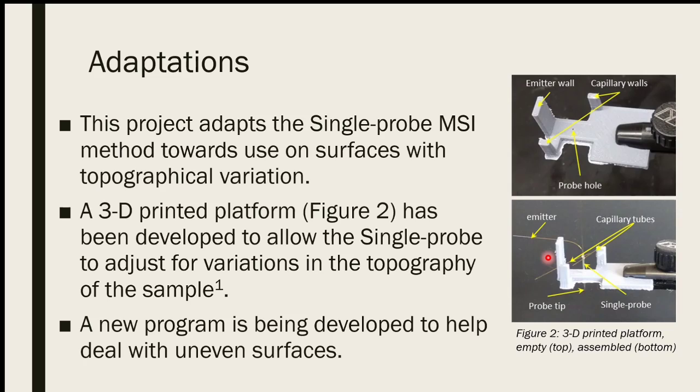For tissue sampling, one thing you can look at is kidney biopsies, and you can see something such as a drug diffusion rate into the kidney. Oh, okay, that's really cool. Yeah, it's really cool. I actually did remember the question I was going to ask you a minute ago.